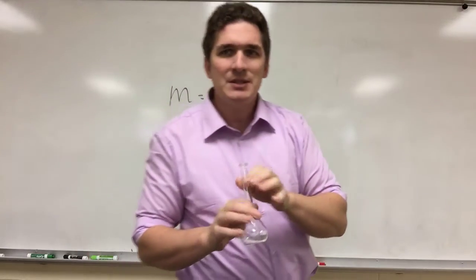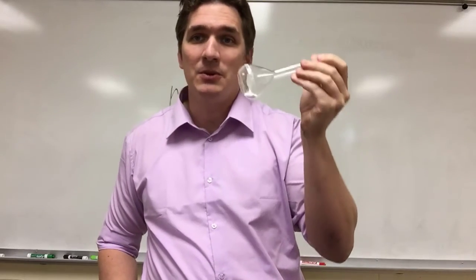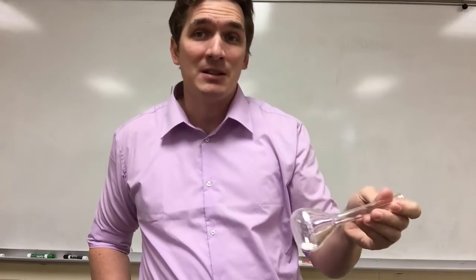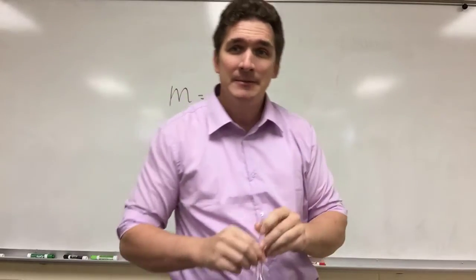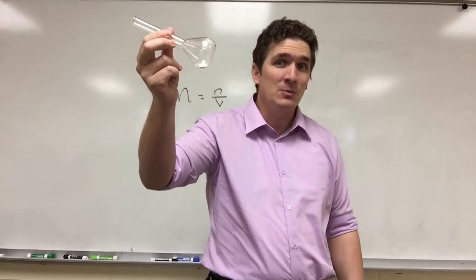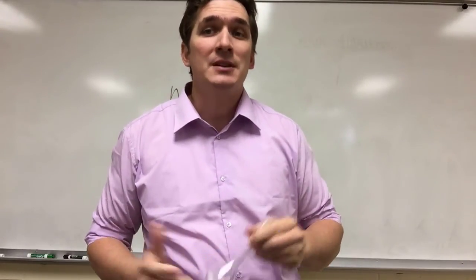To make the solution itself, when you see that molarity, it means a lot of water has been added to it. That's how we actually make the solution. The mass you figure out that you need to make that molarity is definitely less than the volume you're working with. The remaining volume is associated with the solvent, in most cases, water.